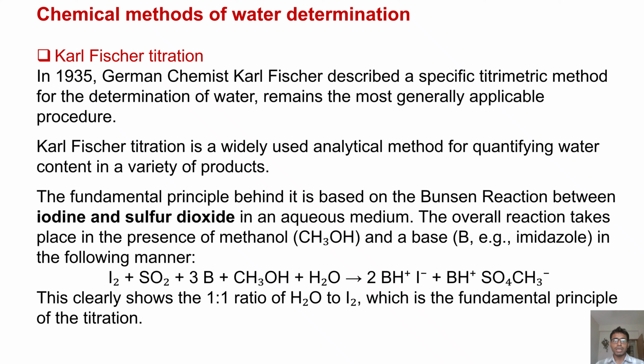Now we will see the most commonly used method for water determination in our pharmaceutical area, because azeotropic distillation has some limitations. It's very much physical, and the machinery or equipment required for water determination by the azeotropic method is much more complex and seems to be very sophisticated.